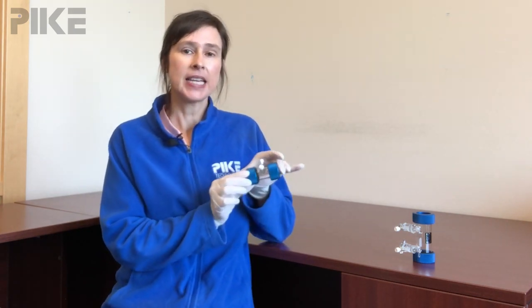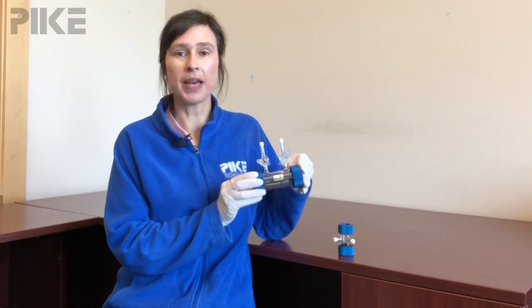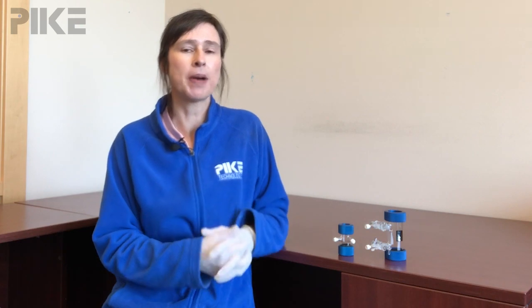Now we have a couple different path lengths. Here is a 50 millimeter and here we have a 100 millimeter path length, and we have a couple different styles. You can visit our website to learn more about that. These cells are really convenient to have in the lab for just a quick qualitative look at a gas. Let me show you how you can fill these really simply.